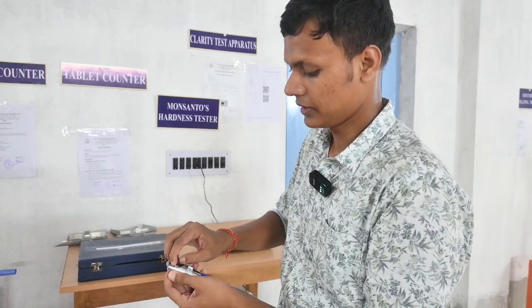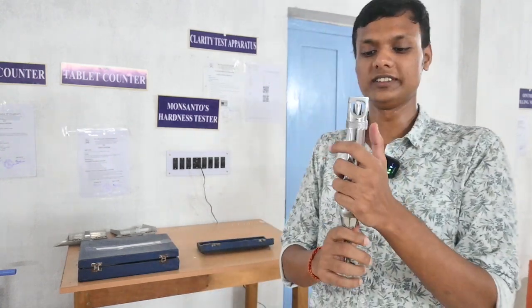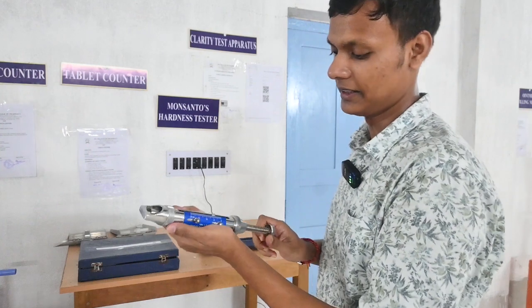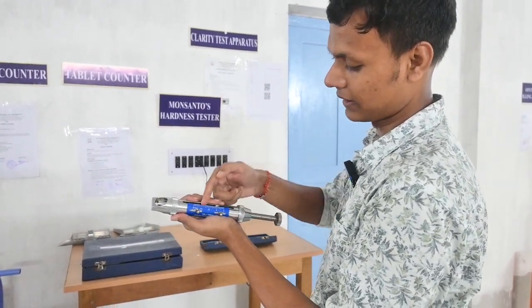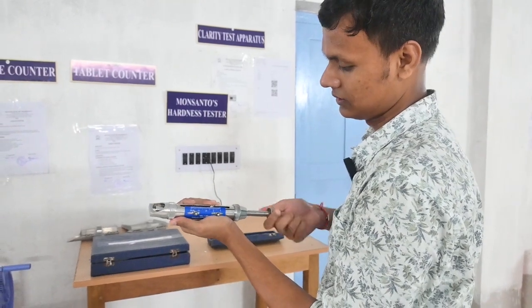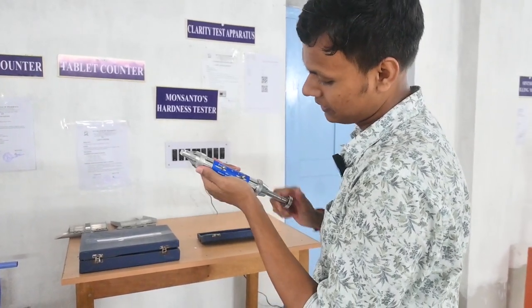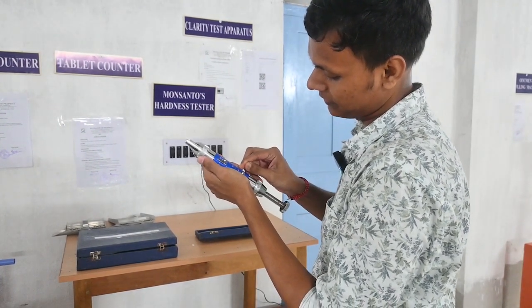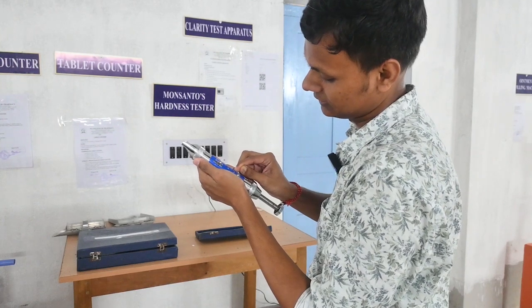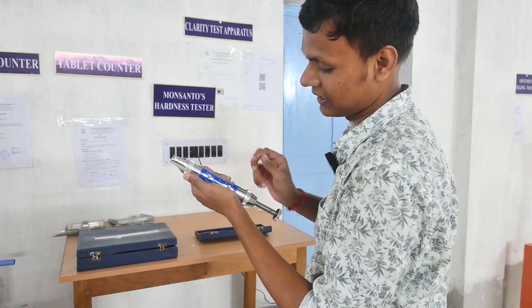The tablet is actually very small — it looks like a small tablet. So this is the tablet. The reading shows approximately 6 to 7 kg, so this is the hardness value in kg.